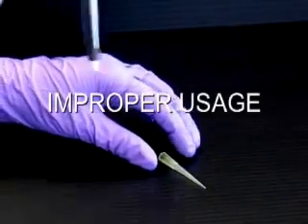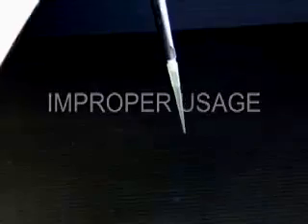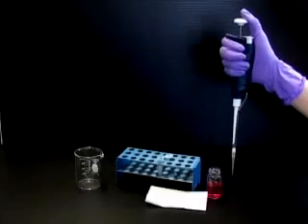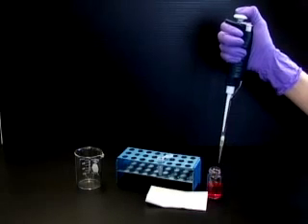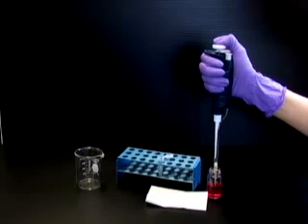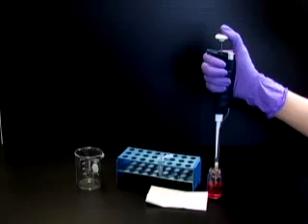Always use a new sterile tip for each sample and never let the tip touch anything except sample. To draw sample into the plastic tip, depress the plunger until resistance is felt. Hold the Pipetman vertically and immerse it into the sample. After the tip is immersed, slowly release the plunger to draw liquid into the tip. Wait a few seconds to ensure that the full volume of sample is drawn into the tip.